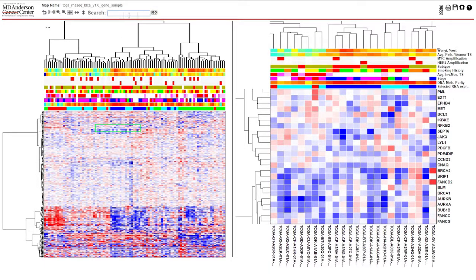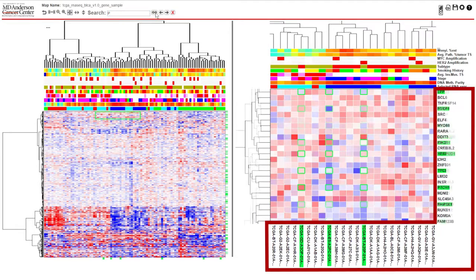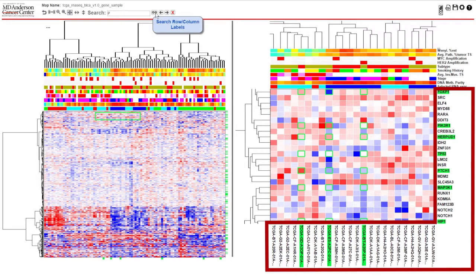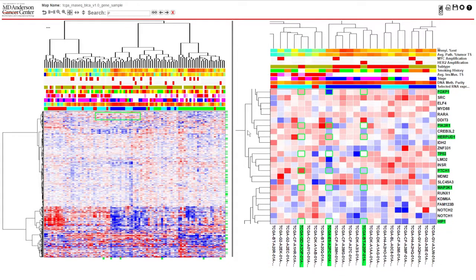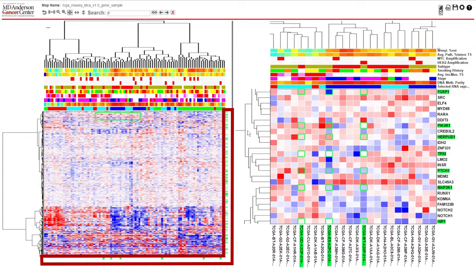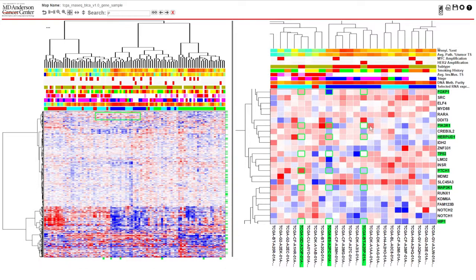You can search for full names or type in key letters to highlight labels. Once you search for a term, it will be selected on the detail view. On the summary view, a colored label will appear to show you where each of these are located on the heatmap. It will select items in the row and column categories.